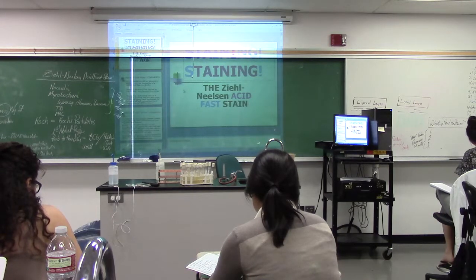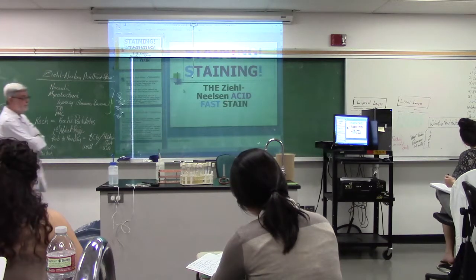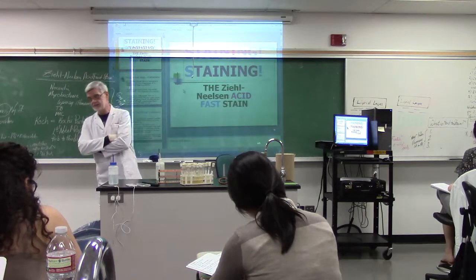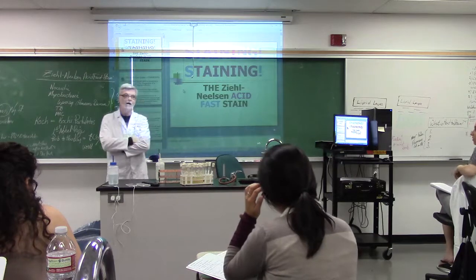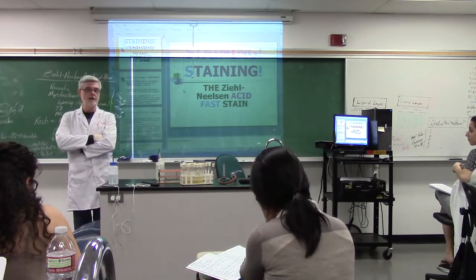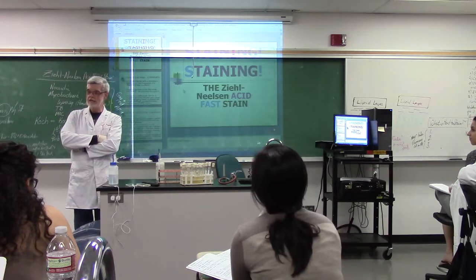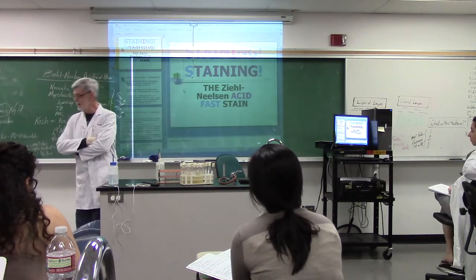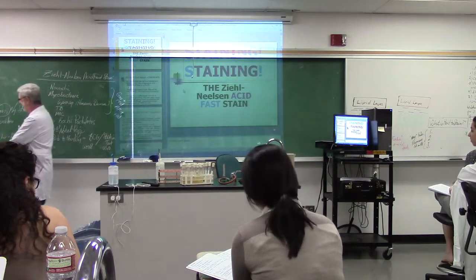200 multiple choice questions over the microscope, focusing the microscope, care of the microscope, everything about smears, everything about stains, theory of stains, hypothetical situations on stains, everything you can ever think of that we've gone over, and maybe 1 or 2 questions on what the word organized means? You know, always go back and pick up 1 or 2 on the previous. That'll be the lab practical next Wednesday.